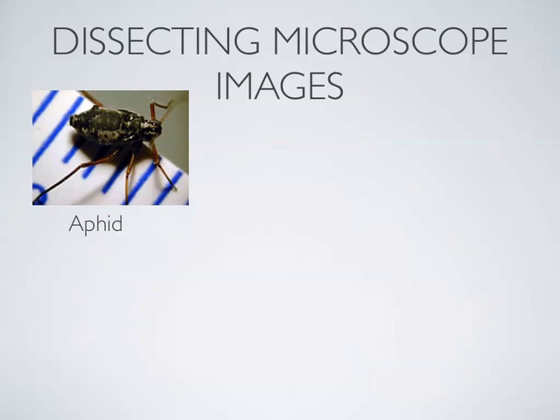Okay? And so when you're using the compound microscope, obviously you're generally using one eye, and so you don't get a good sense of depth perception. Now, how many of you wear contacts? If you've ever lost just one contact, you may have noticed it's hard to see how near or how far something is. If you have played sports and you lose a contact, it's hard to see that ball coming towards you. Because having two eyes facing forward gives you good depth perception. Even if you close one eye and you try to grab something in front of you, it's much harder to do. In fact, 3D glasses work based on this principle.